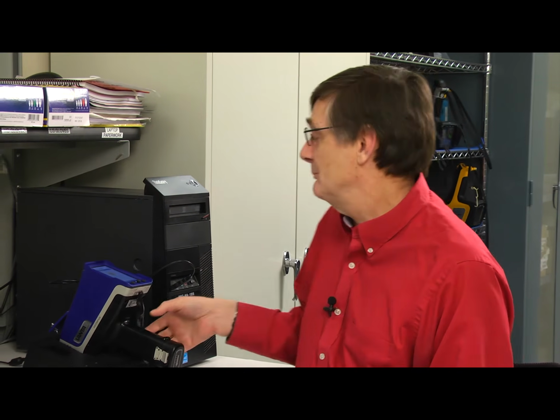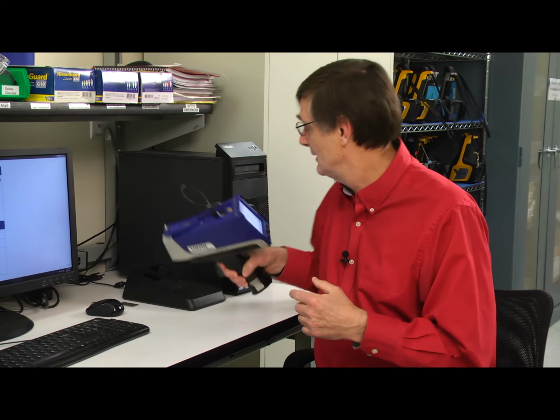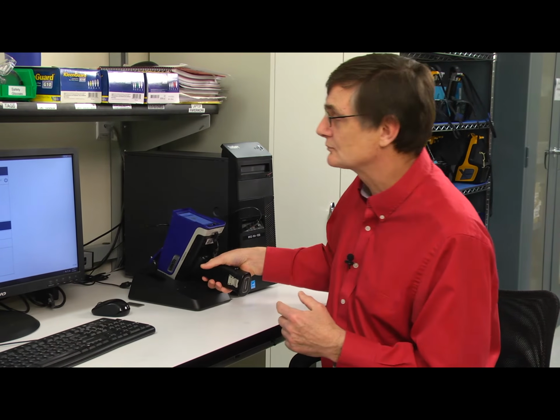The PC software comes on the USB drive that comes with the analyzer. So just copy the installer from that USB drive onto your PC, double-click the installer, and follow the instructions on the screen. You're also then going to want to power up the VANTA, but don't log into the VANTA. Just connect it with the USB cord that comes with the analyzer in the case.